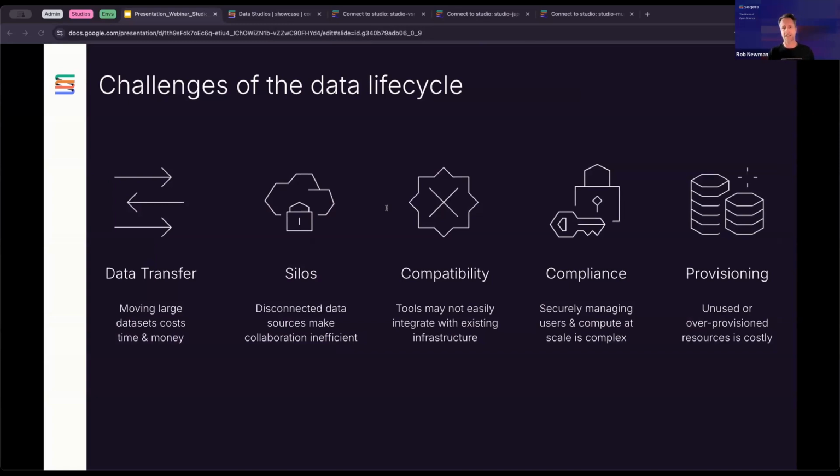Transferring the typically large data sets commonly used in bioinformatics from cloud storage to your local hosts for direct analysis wastes time and it costs money in egress charges. For example, Amazon S3, after you've gone through your first 100 gigabytes of egress per month, it's 9 cents per gigabyte for the first 10 terabytes that you download. Also, transferring data between regions also incurs charges for both the storage and the destination region, with egress charges typically around 9 cents per gigabyte as well.